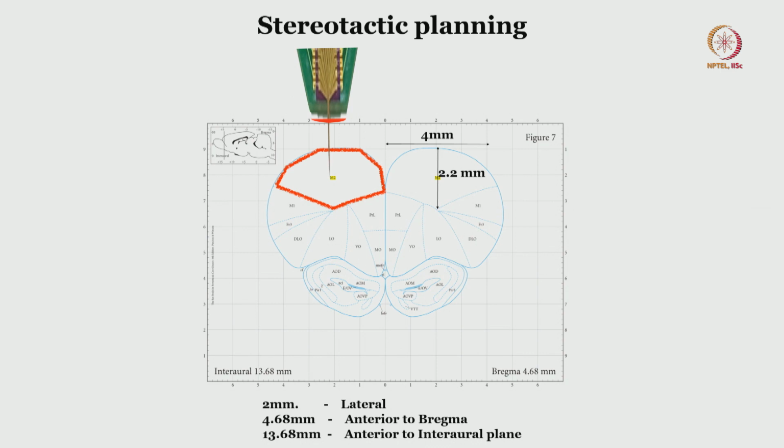As I said, that is going to have a bigger bearing, and unless you plan your entire surgery, every single step has to be planned before you execute it, for a simple reason that it can't be undone. So better you have a mental picture of every single step that you are going to perform. If possible, have a dry run without the rat. Especially for all the electrical setup, I suggest a benchtop testing, and checking the electronic apparatus completely before you start the experiment.